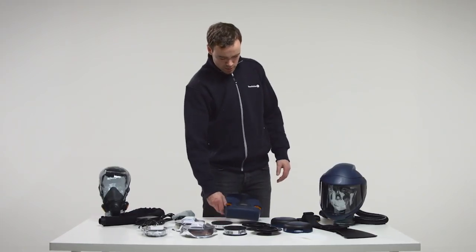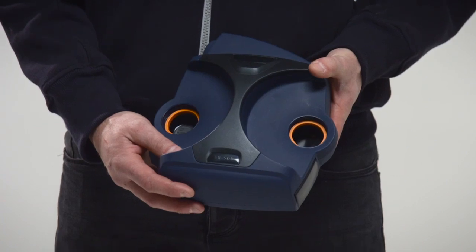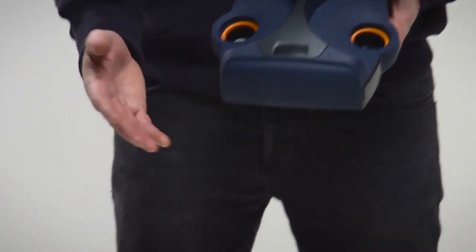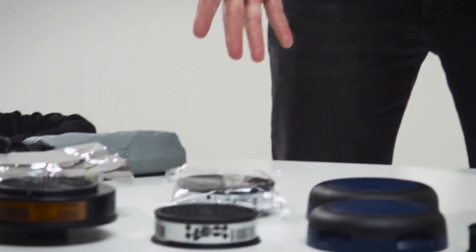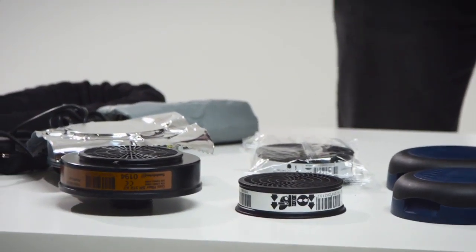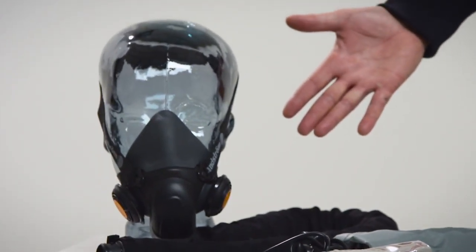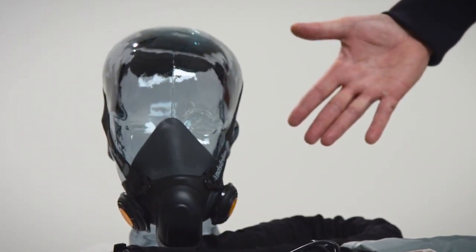The SR500 is a battery-powered fan unit that, together with filters and head-top, is included in the Sundström Fan Assisted Respiratory Protective Device systems.